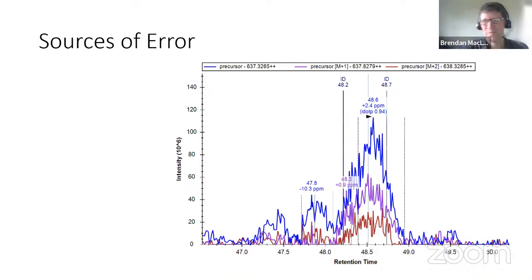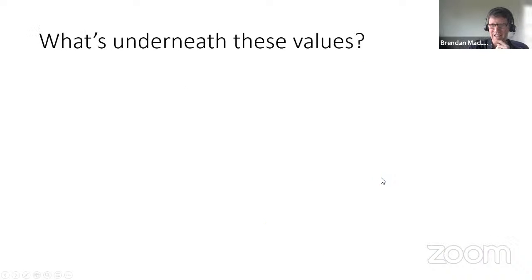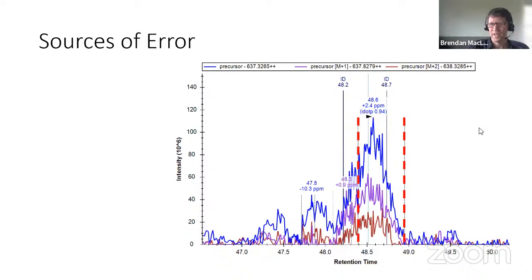So I think actually it's a couple levels down from the satellite view, which is looking at the chromatograms. This is a plot from Skyline explaining how it got the peak area for this particular thing, where this little arrowhead is pointing at a peak apex. And I'm going to highlight these integration boundaries that Skyline chose.